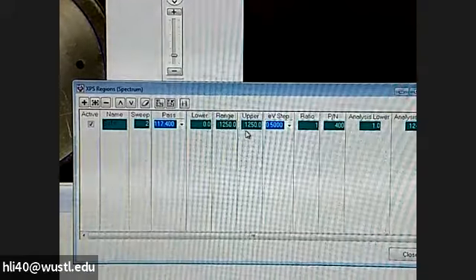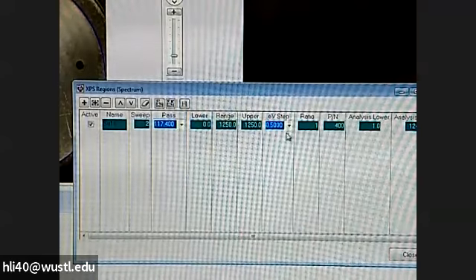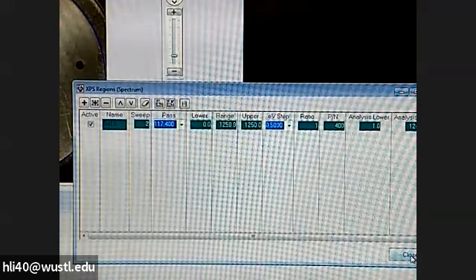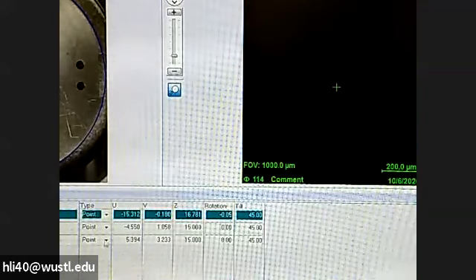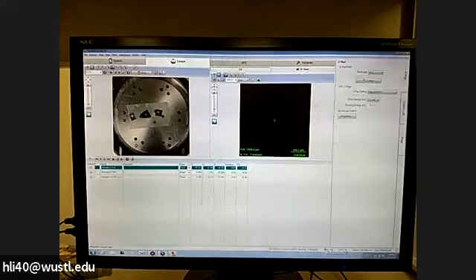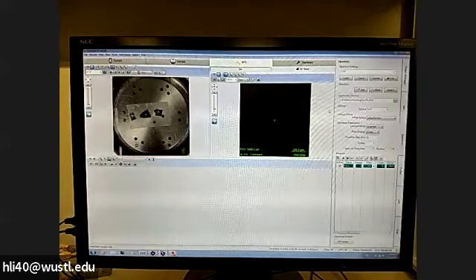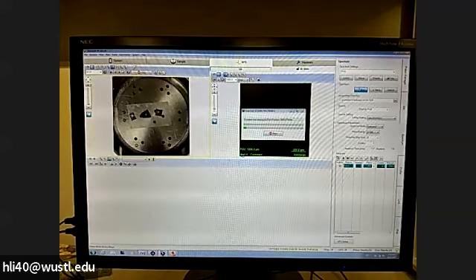So you should set the range first before you adjust the low or upper range. For the EV step for the first scan, we put 0.5 EV per step, then we close it. That's the setting. Now we double check: we have 1, 2, 3 samples. We need to do the survey selection 4. We also need to do the automatic zero line, which is here, let's say it's auto. So we come to the XPS and select SPE, that's it.